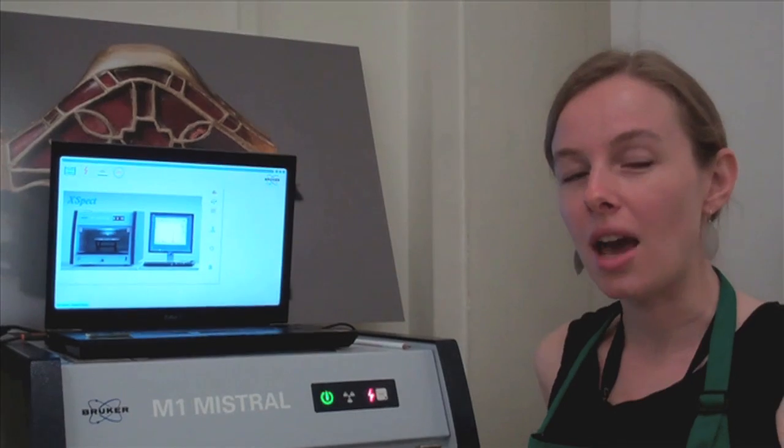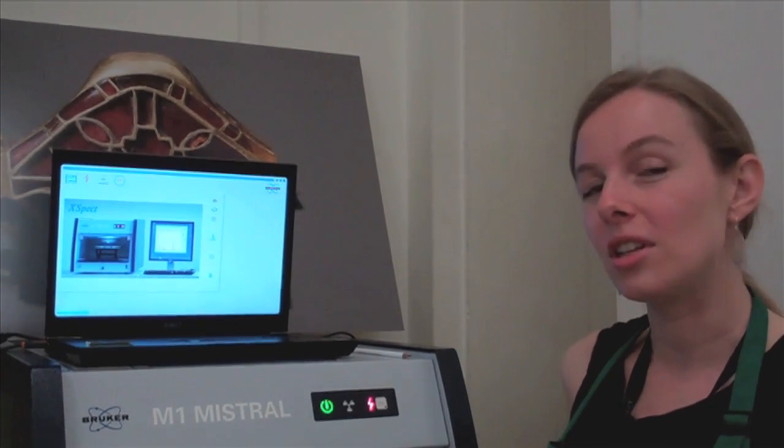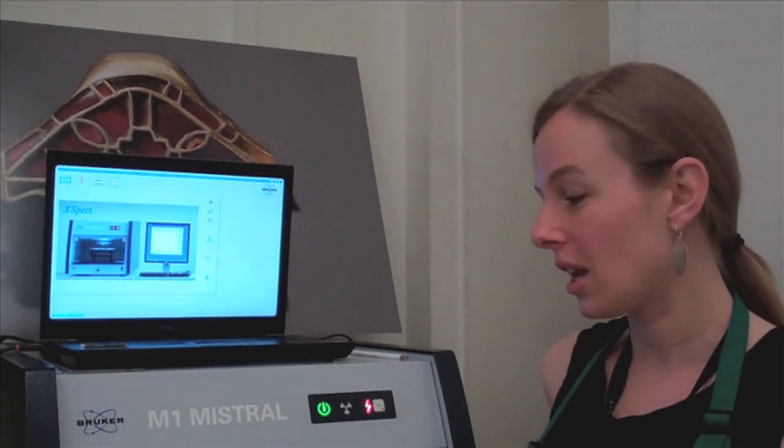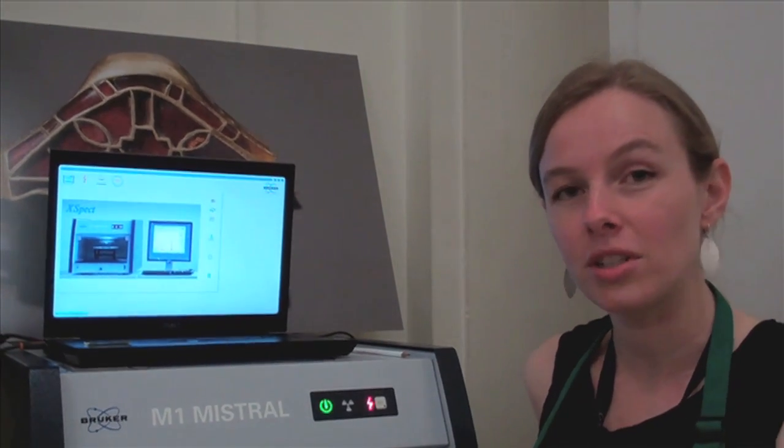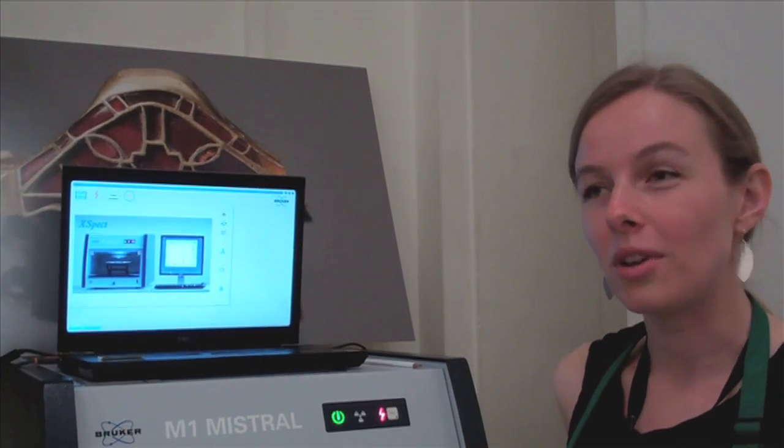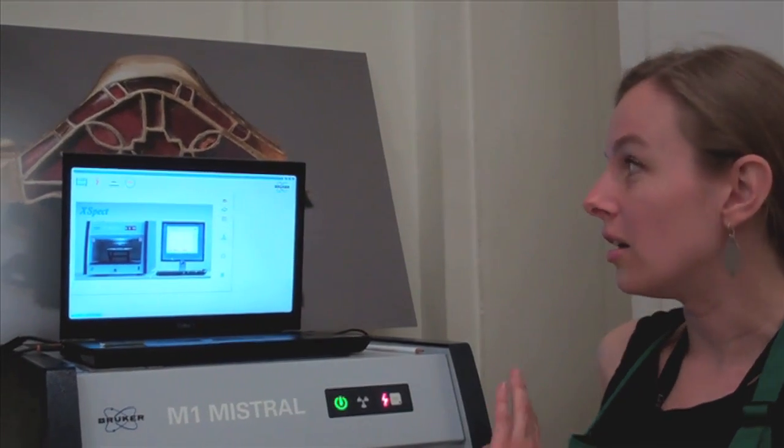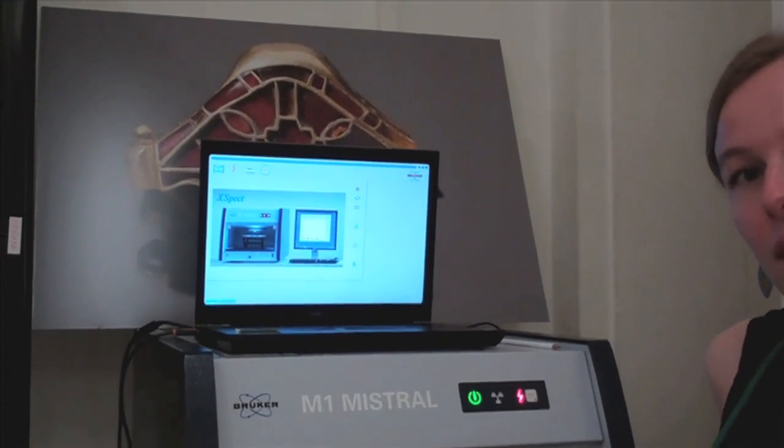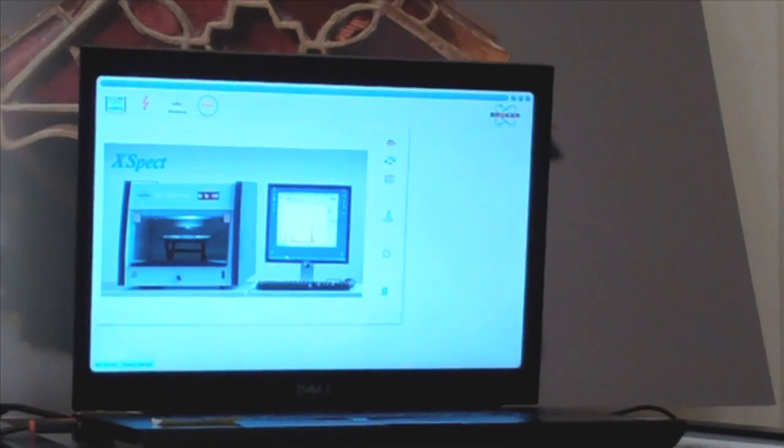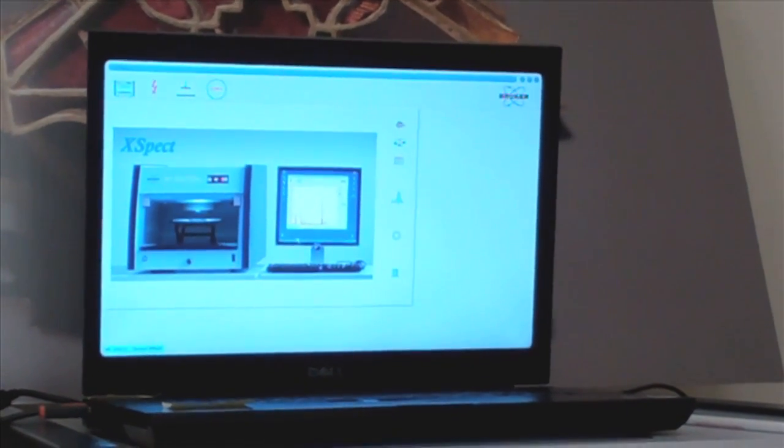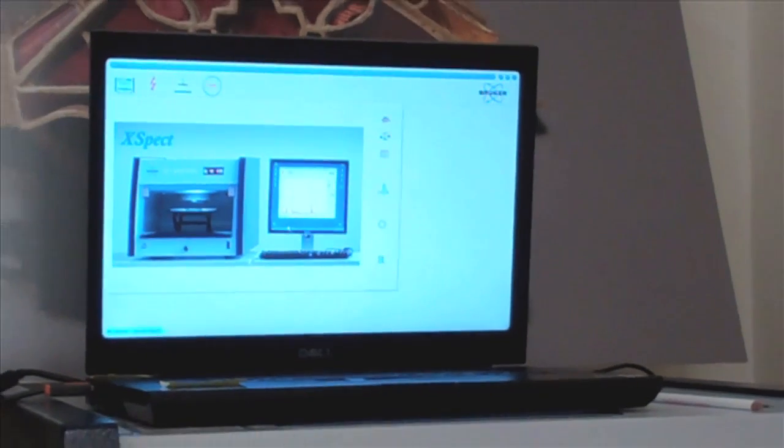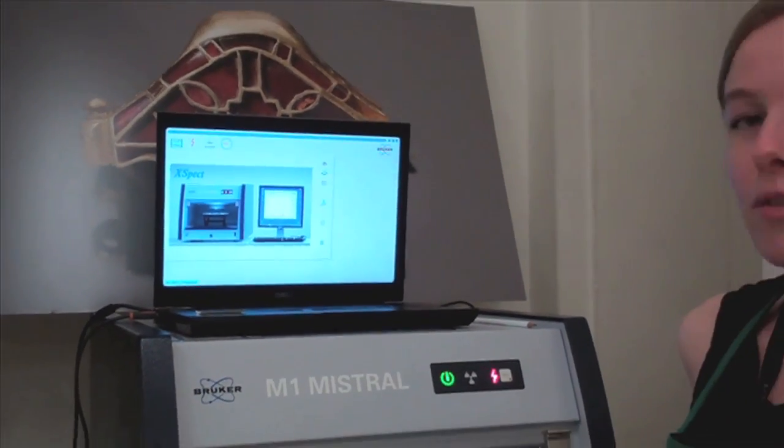So the first step when we use this machine is to do a calibration for the machine of a known standard. So in this case we use a silver calibration, which is a known percentage of silver, and this is used to calibrate the compositional analysis software which allows us to then determine what percentages of different elements are in whatever objects we're testing. So it improves the accuracy and precision of what we are measuring.